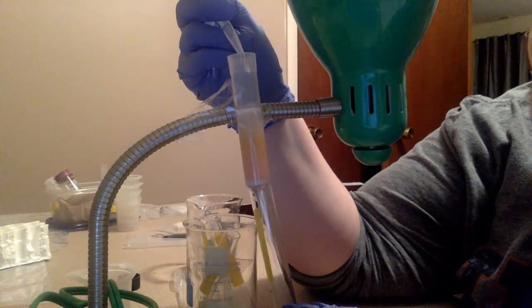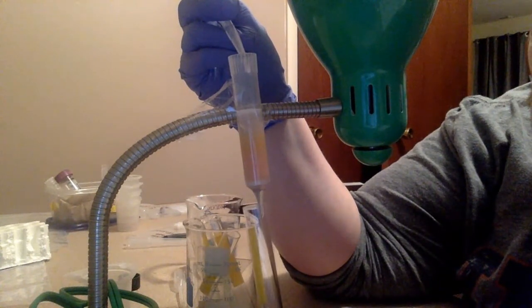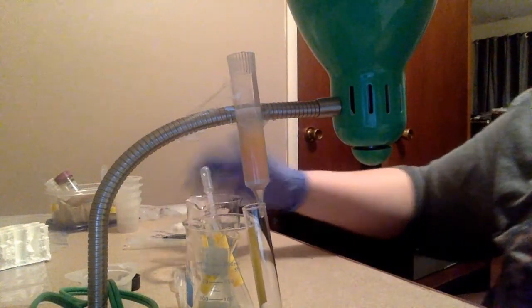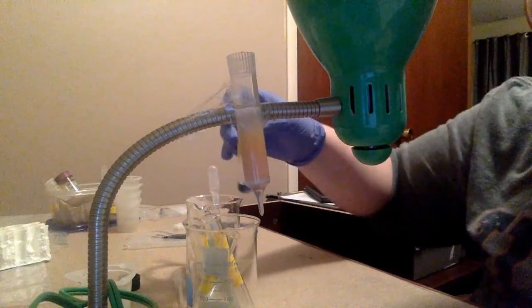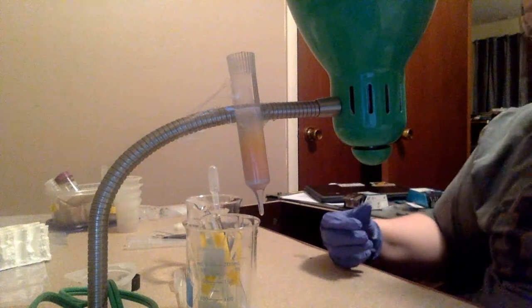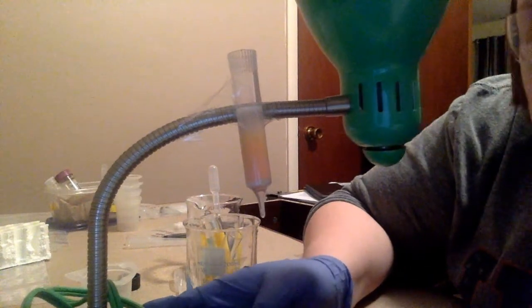So I might have a few more drops of blue here, but if you can tell there at the bottom, it's starting to transition to pink. So I'm getting really close to pink here, and pink is kind of close to the red I'm looking for, so I think I'm going to get out my tube here. So if you see here, there are two colors left.